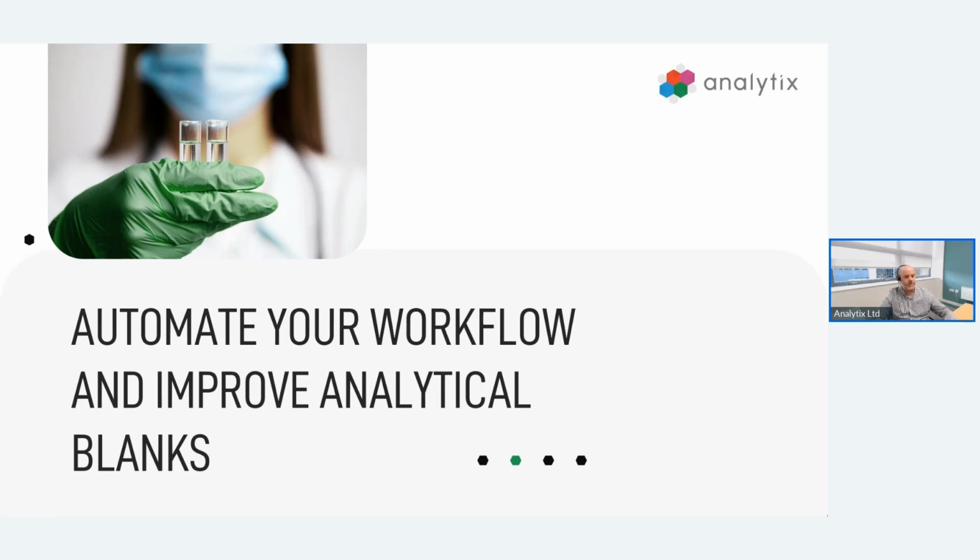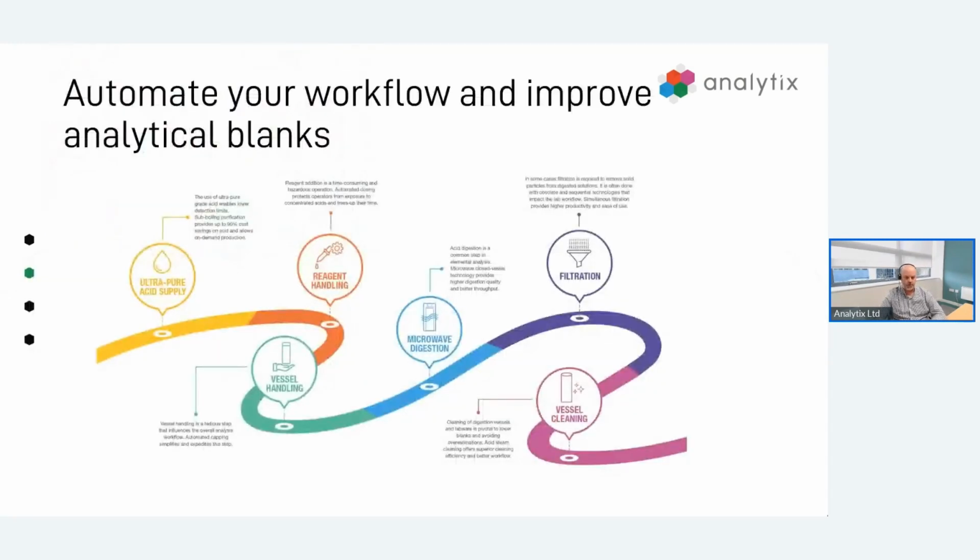Today's webinar is going to focus on the automation workflow associated around improving the analytical blanks for elemental sample preparation. So when we look at this as an overall process in how we handle the sample preparation for getting digestion vessels samples ready for elemental analysis by ICP, we don't just have to consider the microwave digestion or the actual preparation of the samples. We've really got to look at this as a path and a workflow of what happens at the start and at the end of this process.